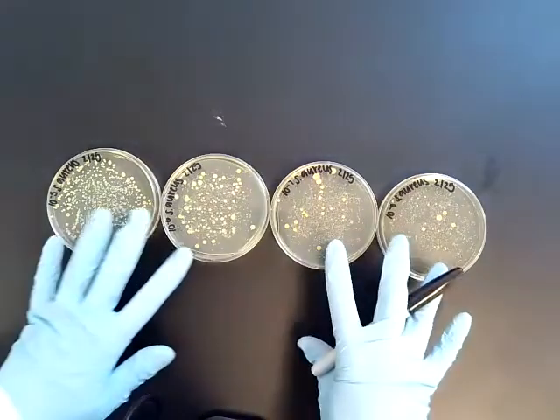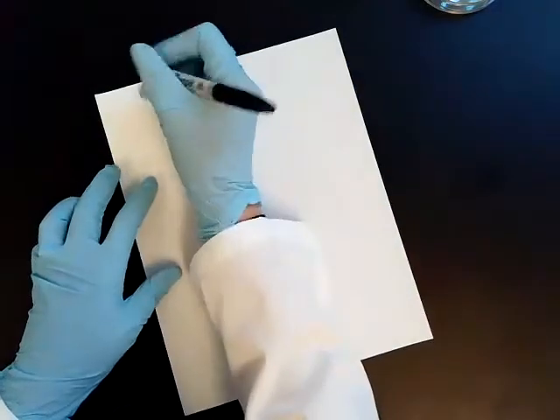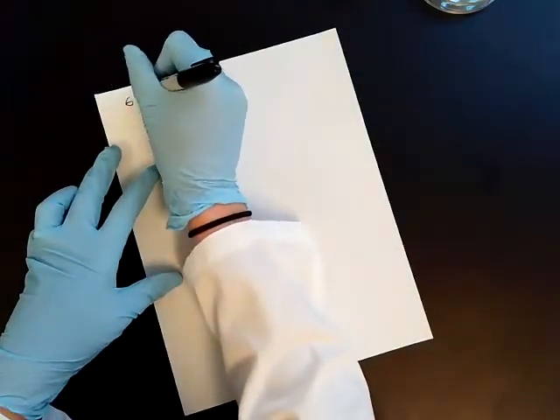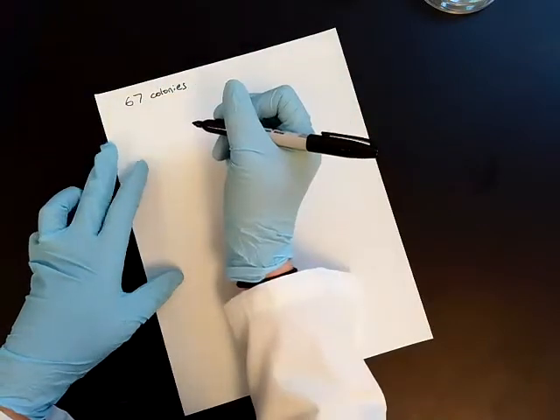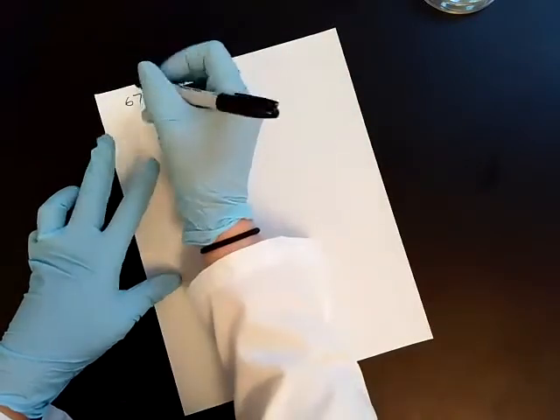So we're not going to actually count these plates, but I am going to talk about the math behind this. When we do serial dilution and we want to calculate the original concentration of living cells in that original culture tube, we need to take into account the dilution factor. So let's say we ended up with 67 colonies, and this was on the 10 to the negative 6 plate.